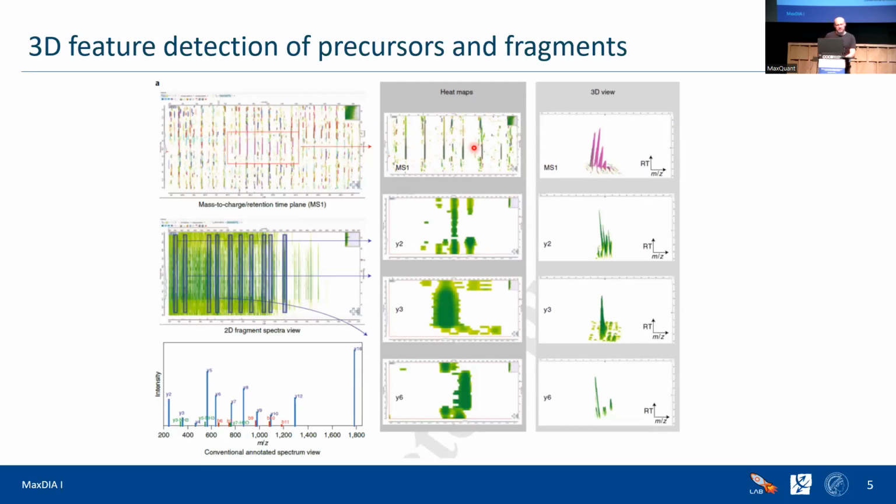One is that it removes noise, because if you now match from the library into the DIA spectra, we only look for these features, right? So we are not picking up noise that is not in one of these feature areas, and we do it with complete features. So either we pick up the complete feature or nothing, basically, right? So you can imagine that removes noise from the MSMS data.